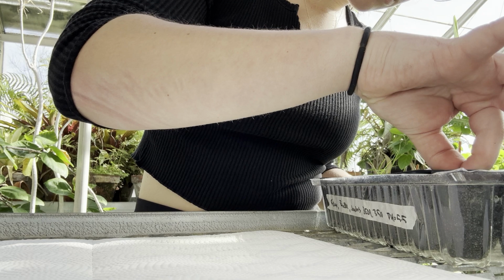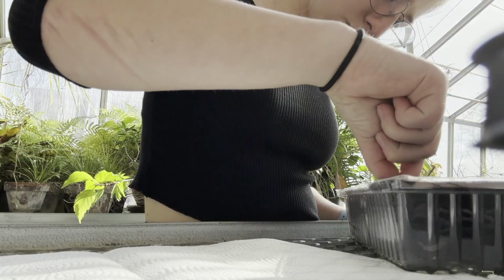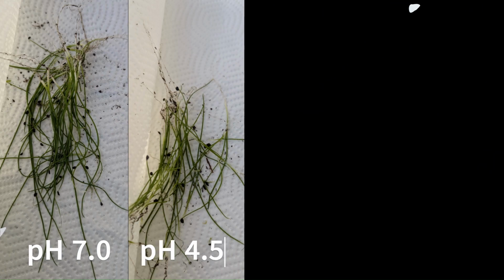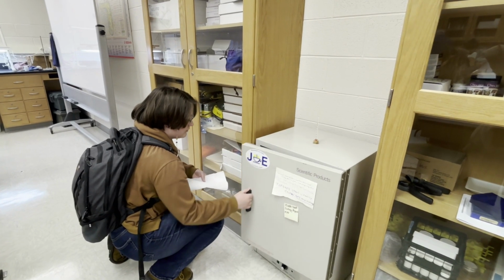After reaching the end of our watering time, we pulled each plant from the cups as carefully as possible so as to not break the roots. We then ran our fingers along the length of the plant in order to get rid of as much dirt as possible. The plants were then placed on 4 different paper towels, 1 for each experimental group. We then used the dehydrator in order to dry out the green onions and collect a final dry biomass.